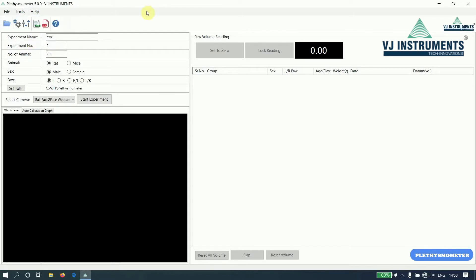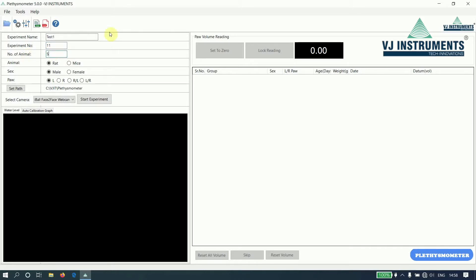Before we start the experiment, let us enter the experiment name, experiment number, number of animals on which we are going to perform the experiment, type of animal, sex of the animal, and the paw.